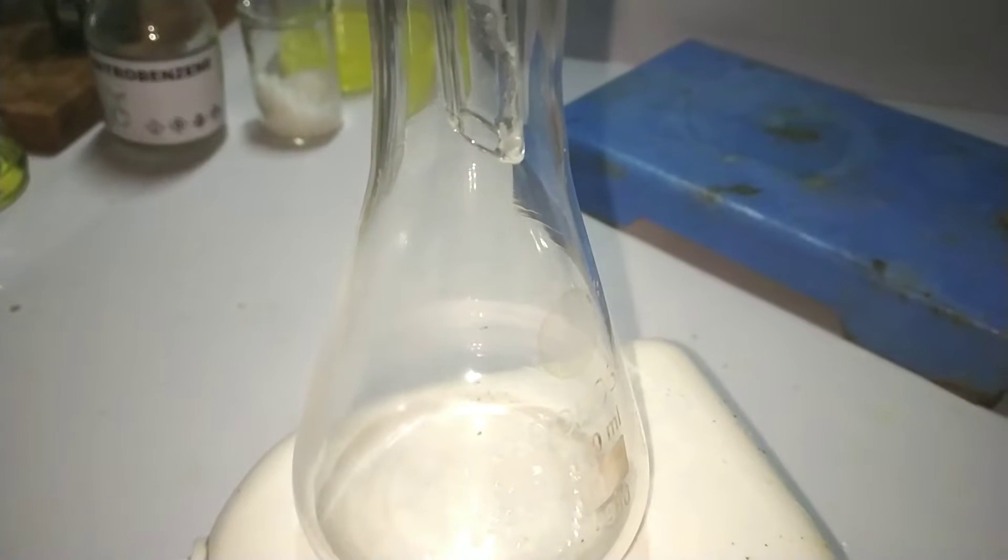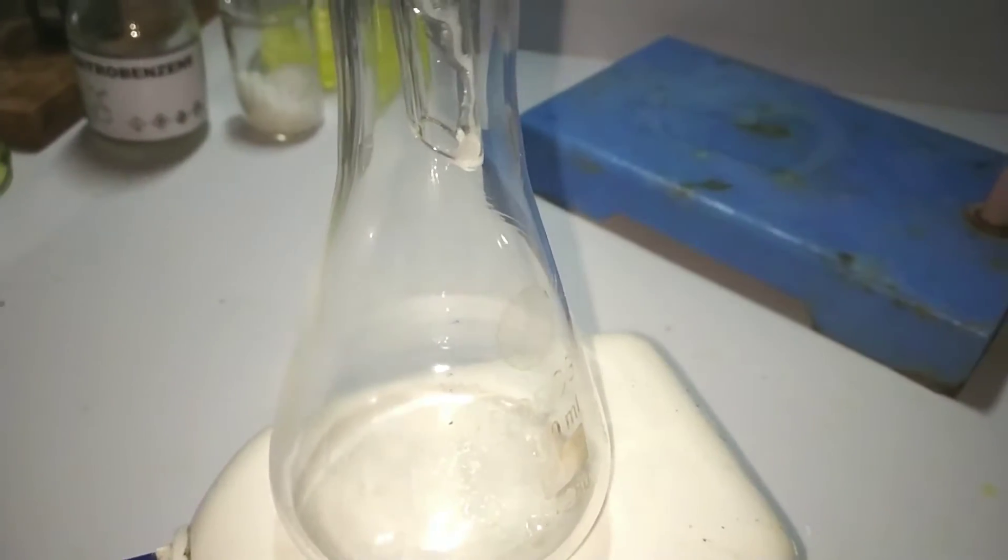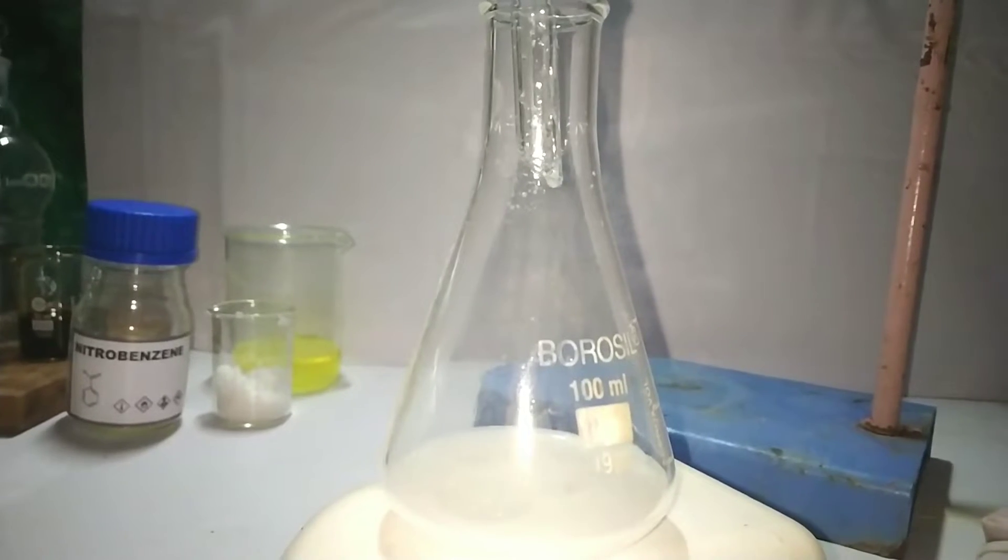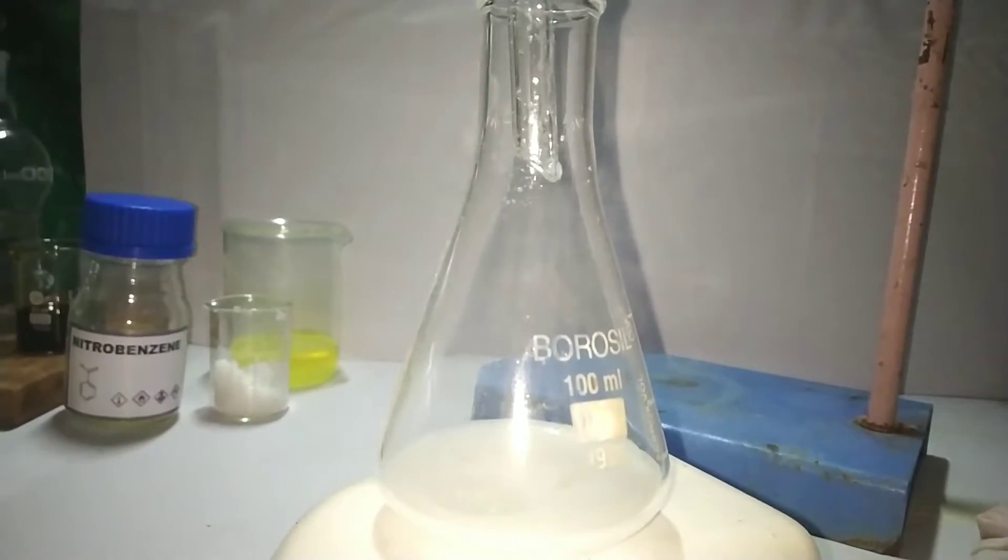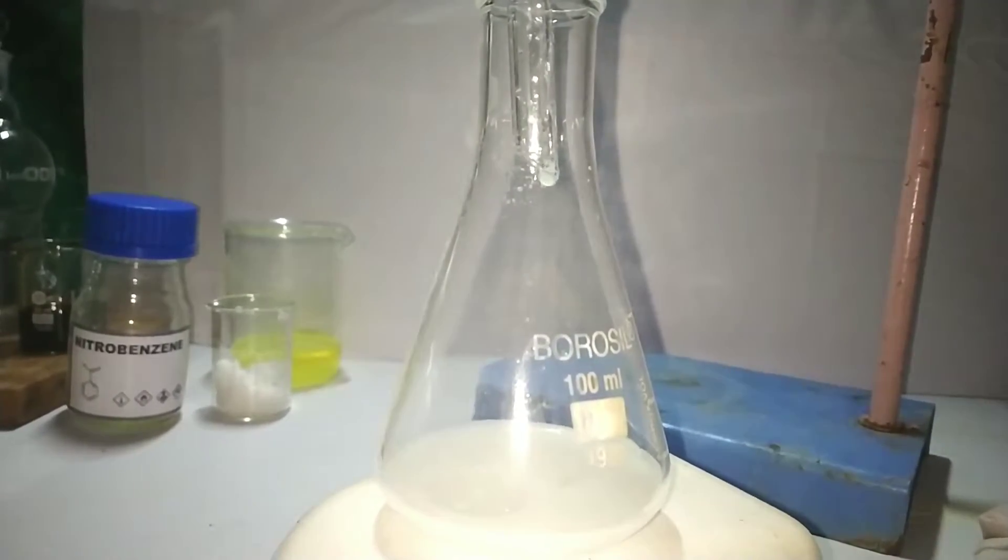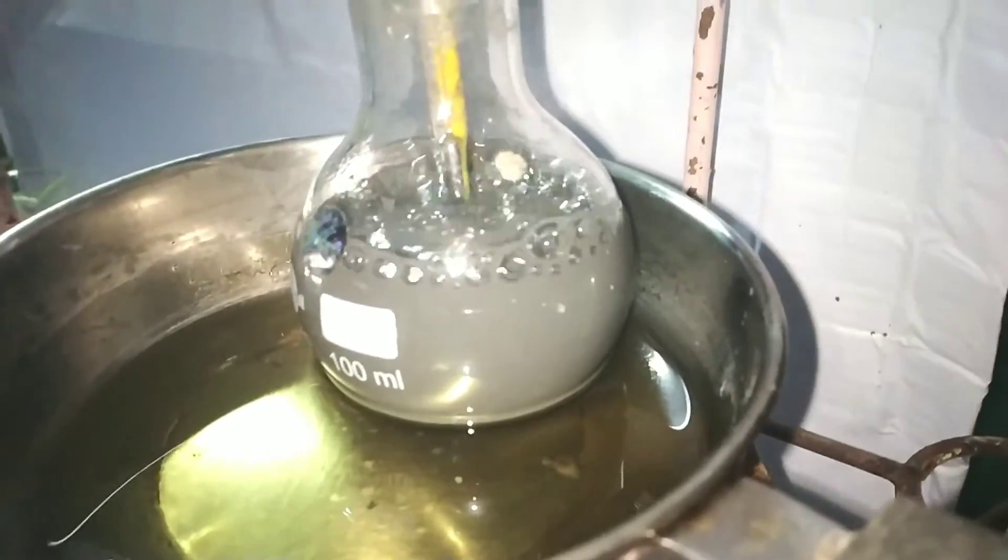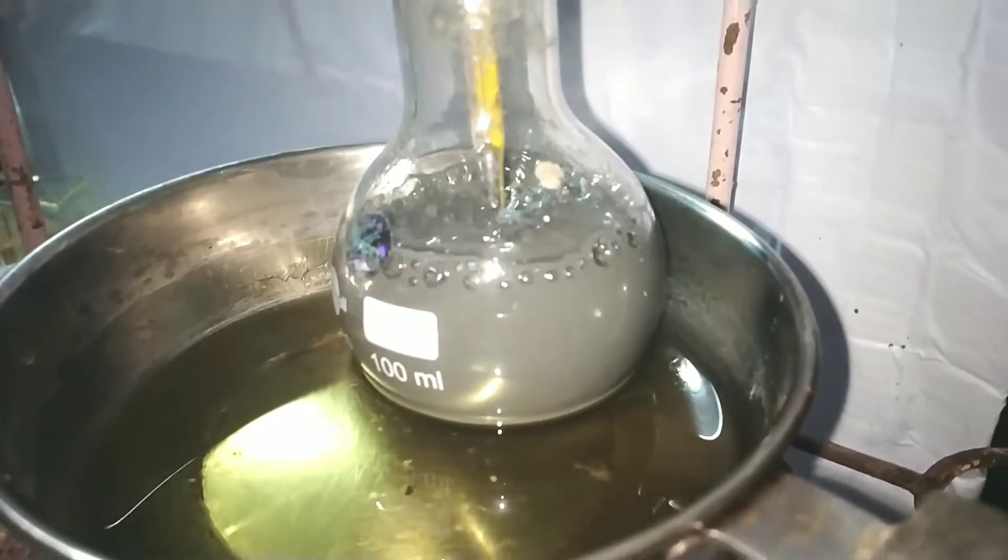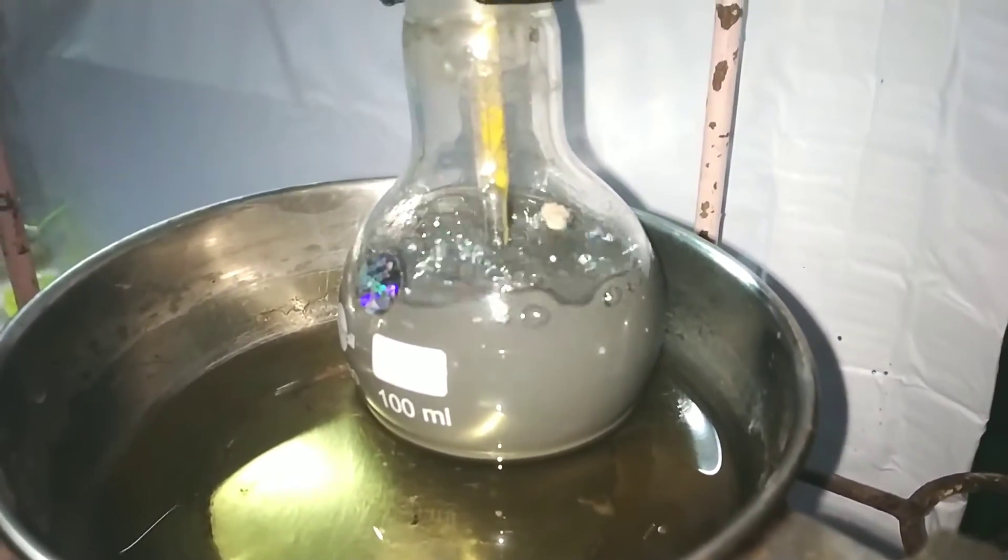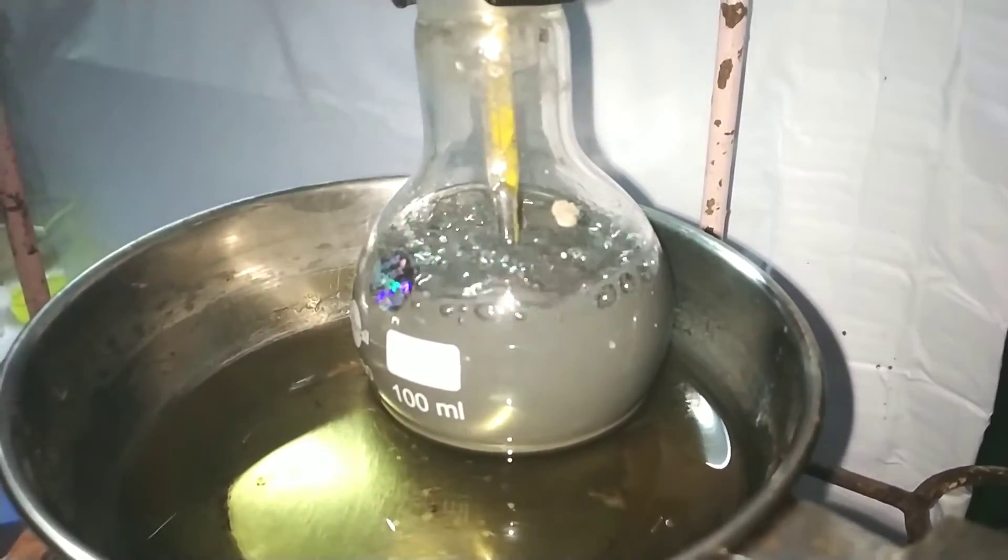Collect around 50 ml of the distillate. After that you can see no more oily droplets are coming out. The distillation flask will have a black colored solution. Now we can stop the distillation.